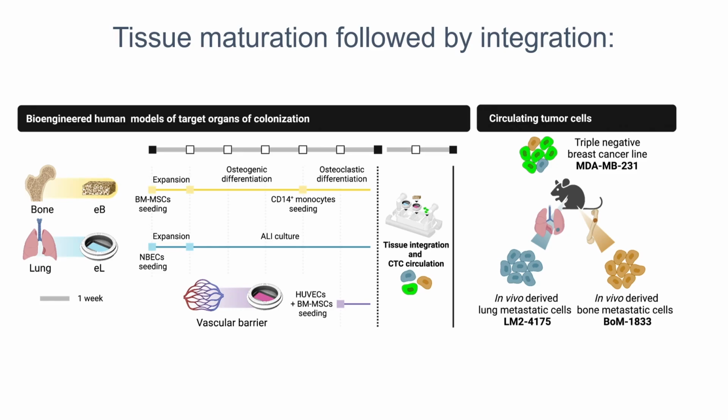As I mentioned for the heart muscle, this is universally true for other tissues. So we matured all these tissues, both tissues and endothelium, before assembling the platform together. And this took us about 6 weeks for bone and a little bit shorter for the lung. And then the integration study, the study of actually the metastasis, this first study was done over the time of 2 weeks.